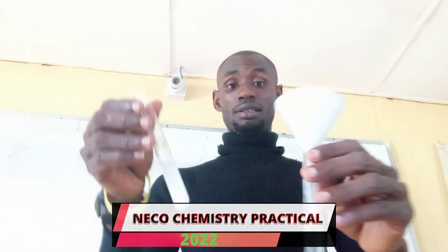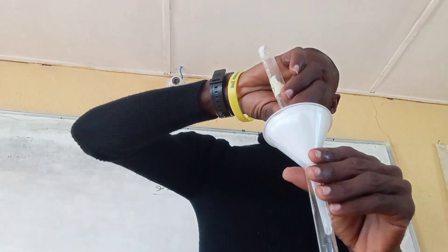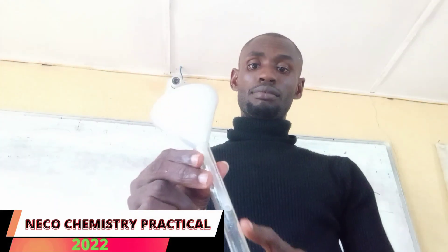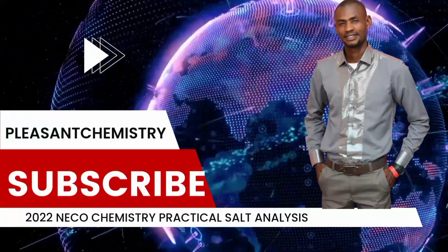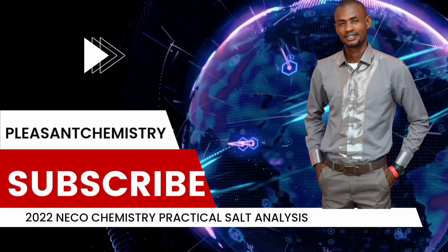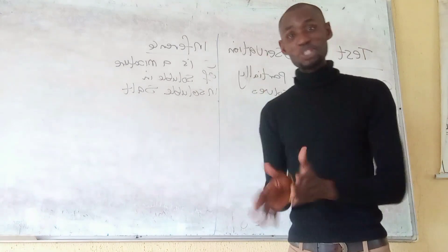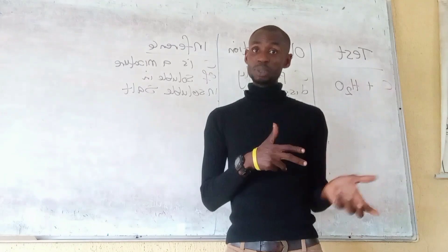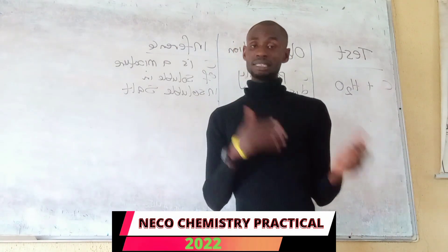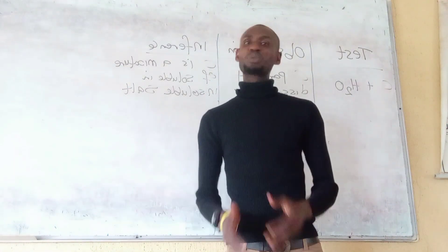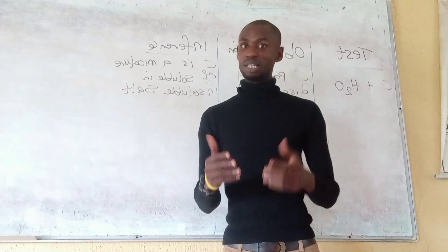Since C did not dissolve completely, we filter it. We put filter paper inside the funnel and wait for the filtrate to collect into the test tube, while the residue stays on top of the filter paper. We keep both the filtrate and the residue and will carry out tests on each.